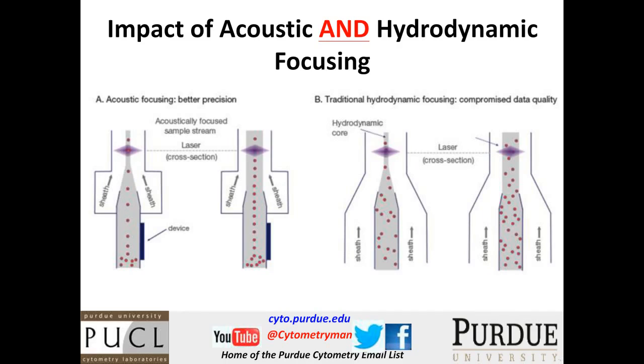And I want to make a pretty important point at this stage. The current version of the acoustic flow cytometer, in fact the commercial instrument that was built, wasn't exactly the same as the original concept that Greg developed. He developed a concept that was basically sheathless. Sounded like a good idea at the time, but practically it is not quite as good as a sheath-based system.